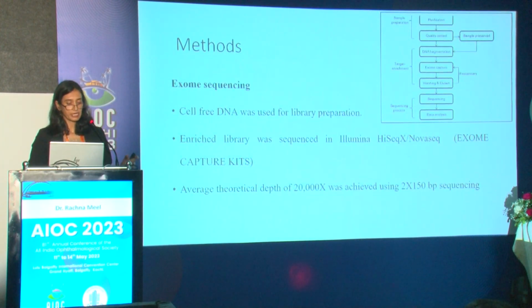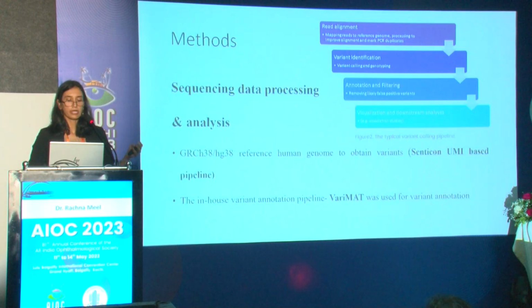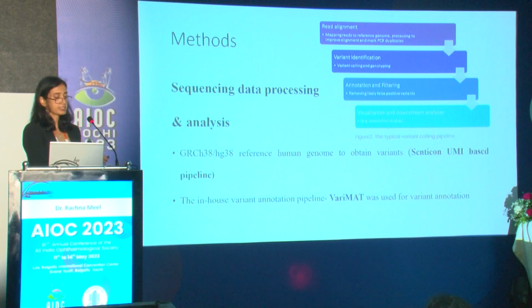Now, for this cell-free DNA, a library preparation is done. Basically, the isolated cell-free DNA is first purified, then enriched, and then we go on and do the sequencing. The sequencing read is compared to a reference genome, which was GRCh38 in our study.